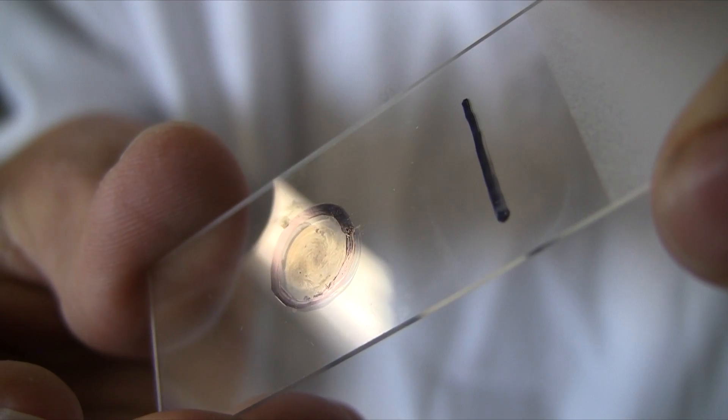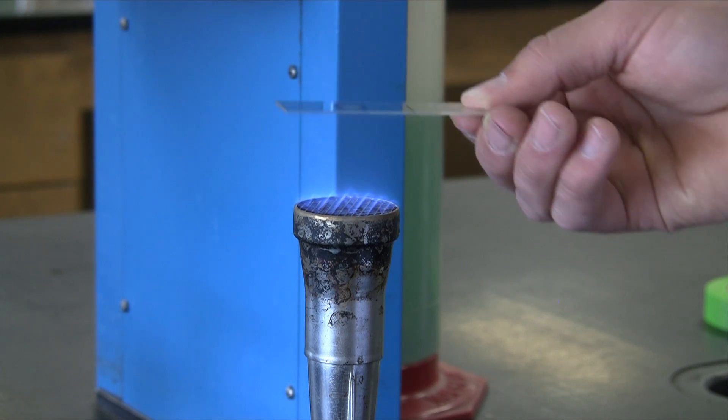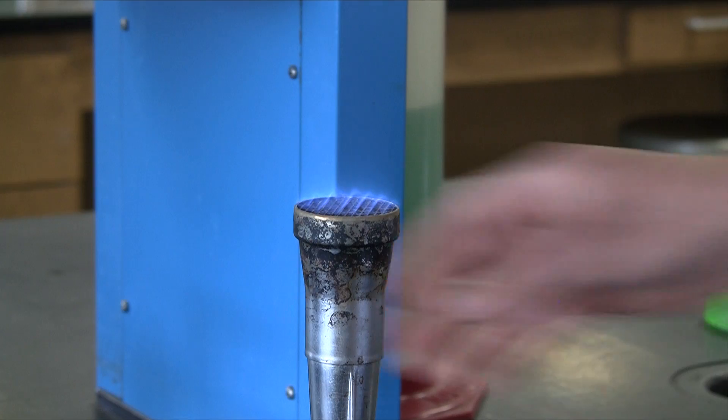Now you've got to air dry your smear, and then we can heat fix it. Pass it two to three times over the Bunsen burner and it should be hot, but not so hot that it would burn you.